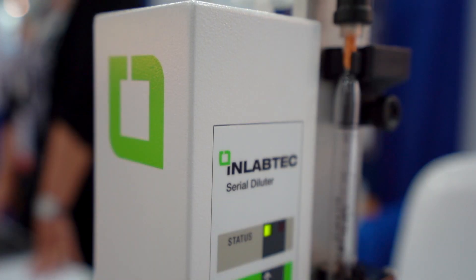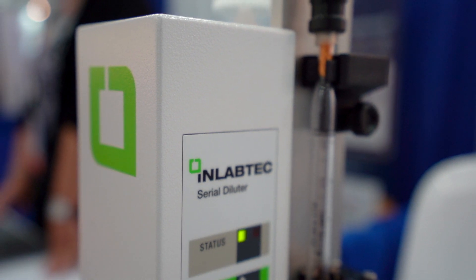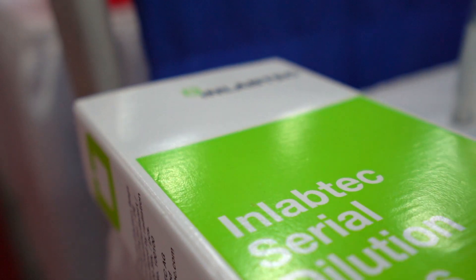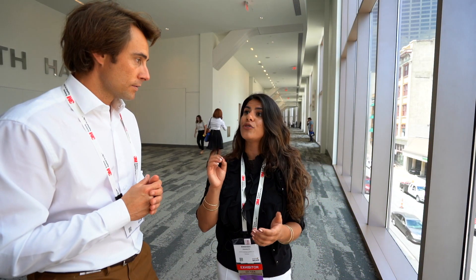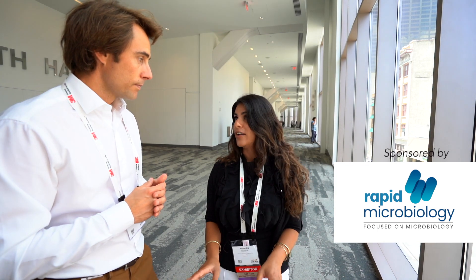I am here to introduce the INLABTEX Serial Dilution System. Essentially we created the system so it's a faster way and more economic way to do Serial Dilutions. Typically people use test tubes, you have to sterilize them and do manual mixing — this gets rid of all of that.